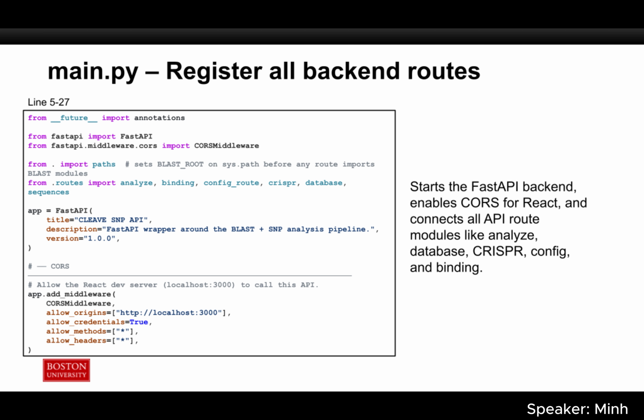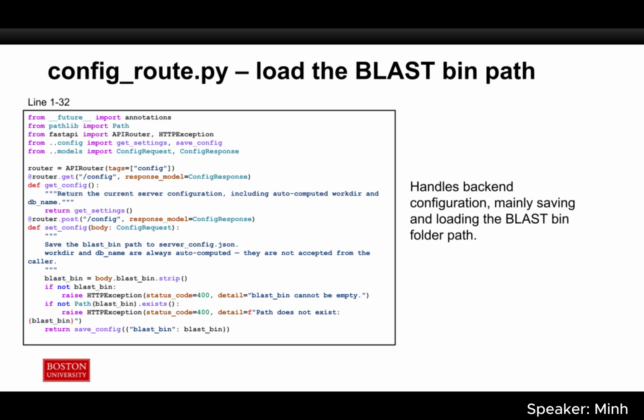In the Python backend, we set up a FastAPI app with CORS to act as an entry point for Uvicorn, and we also implemented some GET and POST routes for the backend APIs, which includes the full BLAST and SNP pipeline, the metadata sidecar, BLAST database, and CRISPR design.